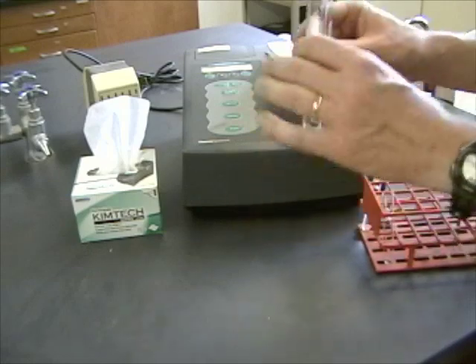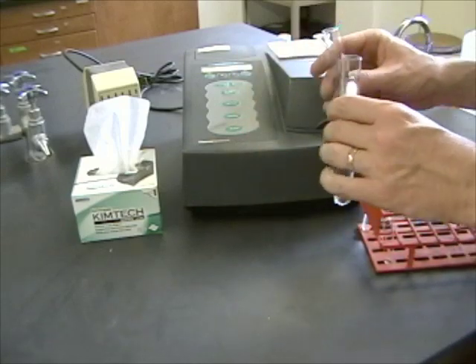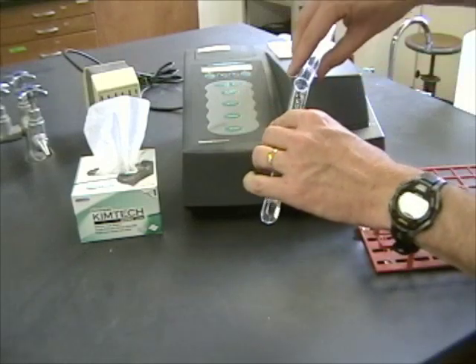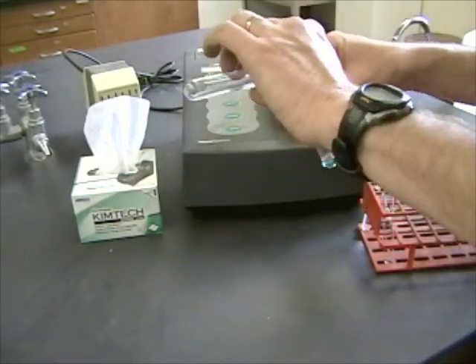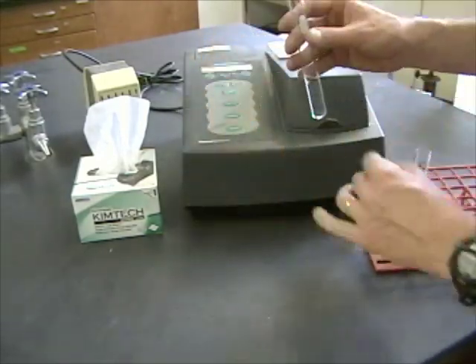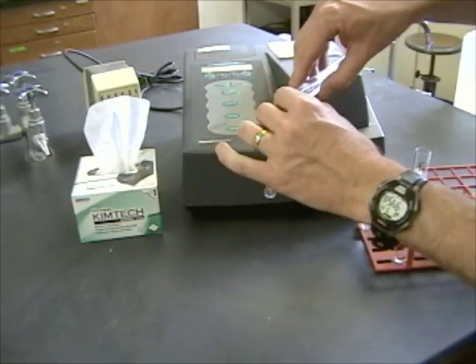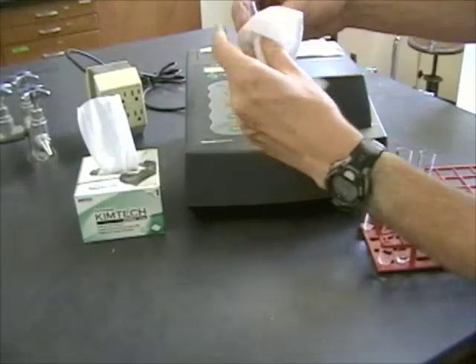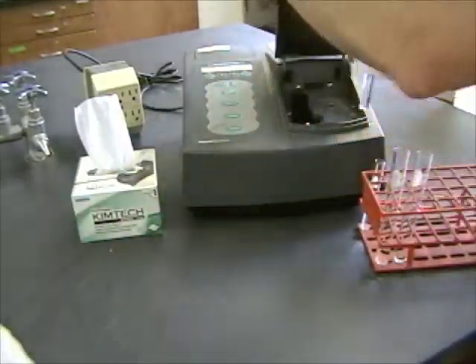As soon as I mix these together, somebody else in my group needs to start watching the clock because we're going to take readings every 20 seconds. I'm going to mix them together by just pouring them back and forth in these big tubes. Then I'm going to fill up my spectrophotometer tube about halfway, wipe it off to make sure there aren't any fingerprints on there, put it in and go.